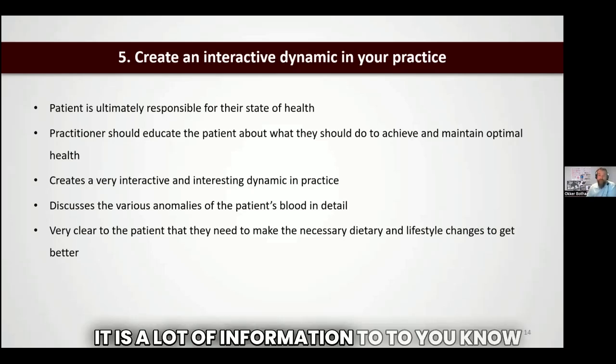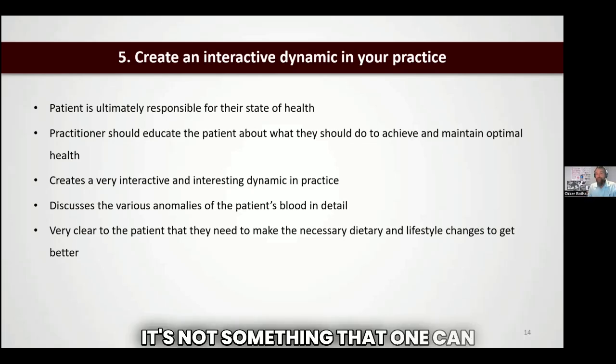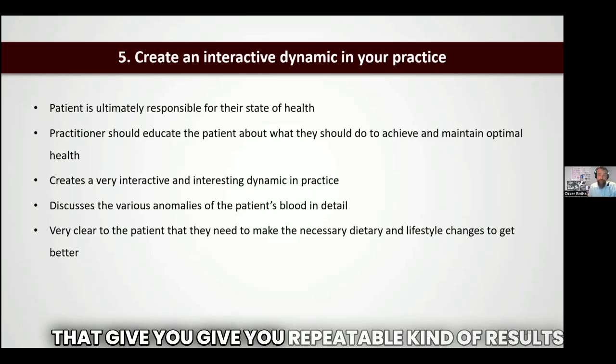It is a lot of information to assimilate, and it takes some time. It's not something that one can really grasp just over a weekend. There's a lot of theory and also a big practical aspect to it. Taking blood samples correctly takes a bit of practice, and one needs to follow the correct technique to actually get reliable samples that give you repeatable results.